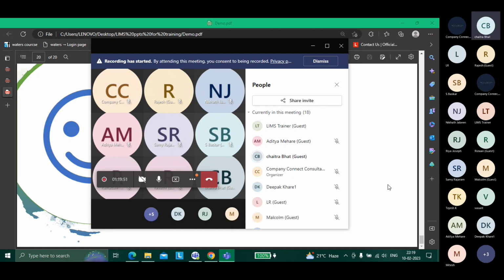You can explain it briefly, right? Not shortly. How to create worksheet, workbook, kind of. That's what, right? Worksheet, workbook. That's a very fast thing. Okay. But I can just teach you basics of what ELN is. But no, even I don't have in-depth knowledge about worksheet, workbook creation. You know, it's very in depth.